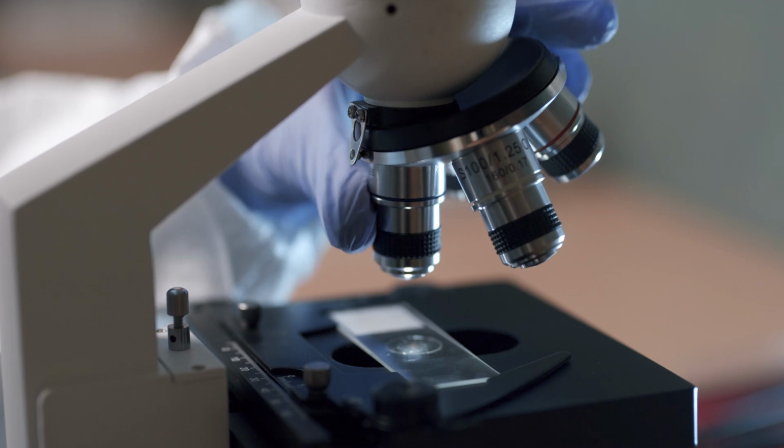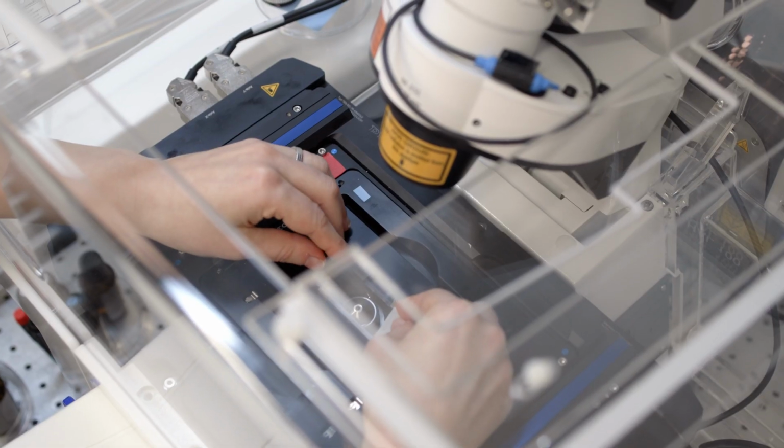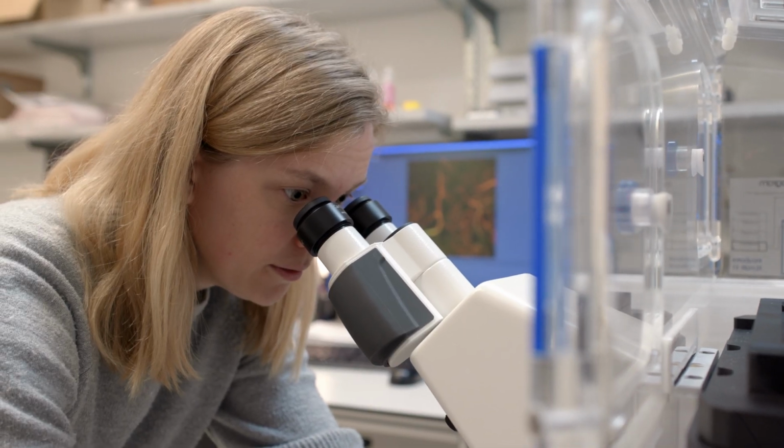And each of these different interactions can be used to develop a new type of light microscopy, things like bright field microscopy, fluorescence, or even confocal, which is a type of fluorescence microscopy. So now biologists have a whole suite of tools available to them to explore their sample with light microscopes.